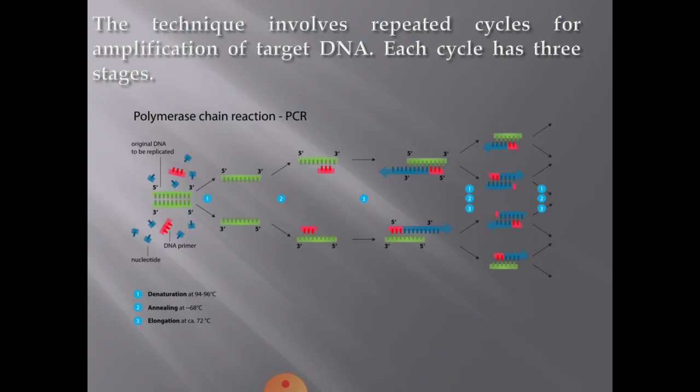Now, the new DNA strands are formed, right? So the new DNA strand joined to each primer, what has been shown in blue color in this diagram, is beyond the sequence. Please note, it is beyond the sequence that is complementary to the second primer.